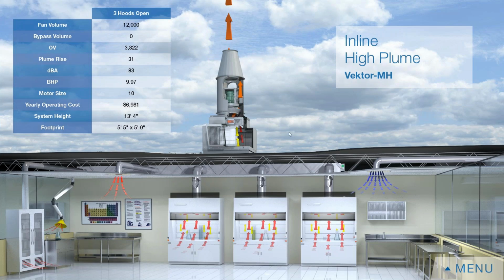Okay, sounds good. So on the screen here, you're going to see your typical lab setup, right? You have a couple of fume hoods, snorkel, storage cabinet, all going up into some kind of common ductwork and then up into the fan.